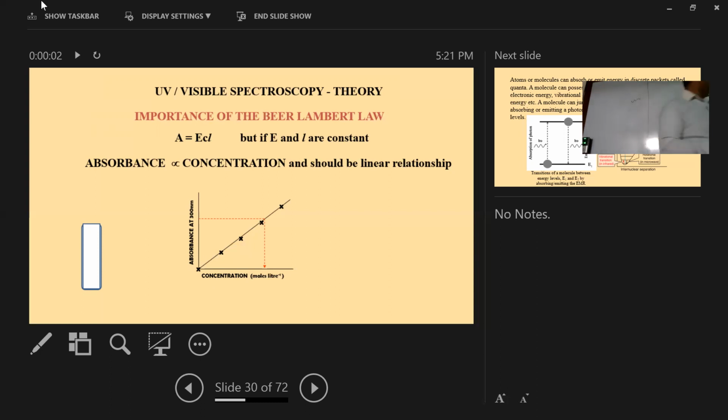You can keep the standard curve a little bit higher. I mentioned 0.01, 0.02, and you can even take a higher concentration, maybe 1 molarity like this. In that case, you can have an absorbance maybe here also.